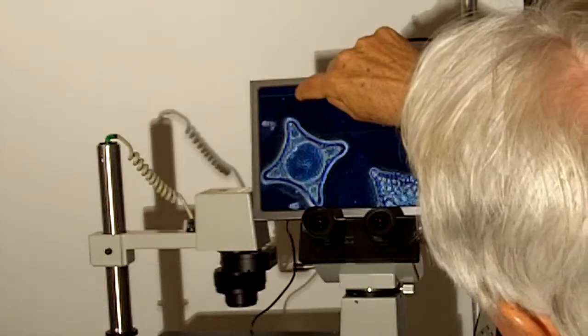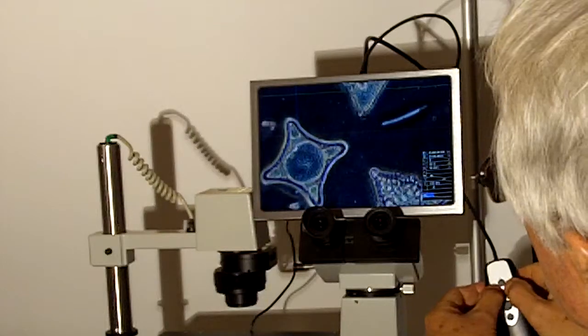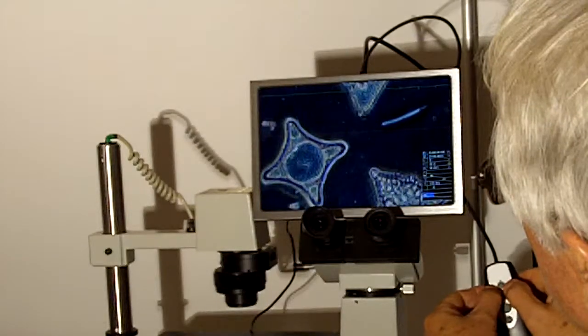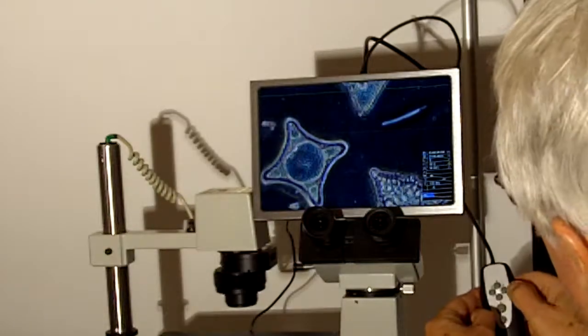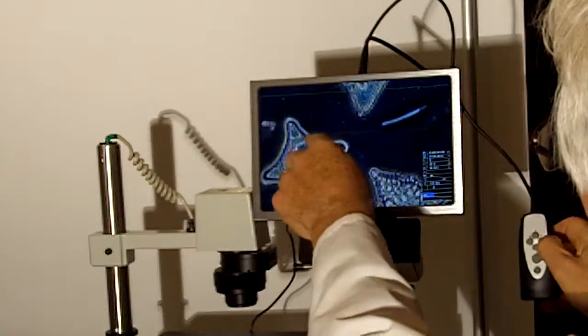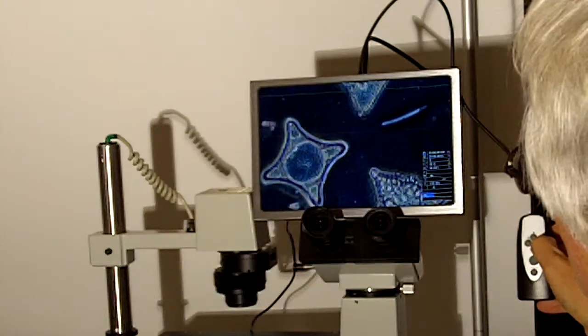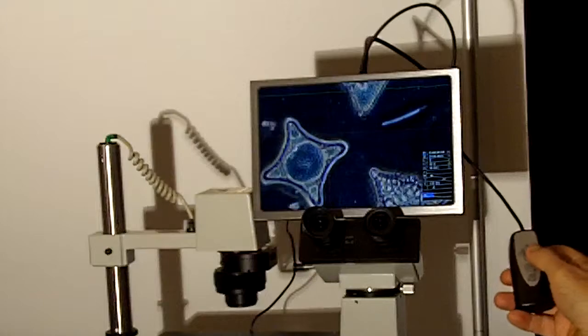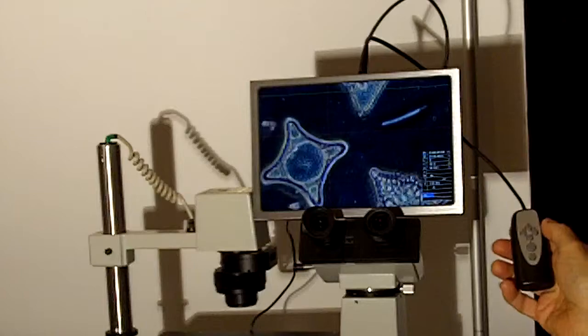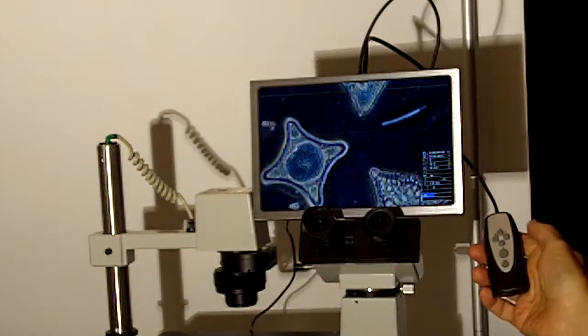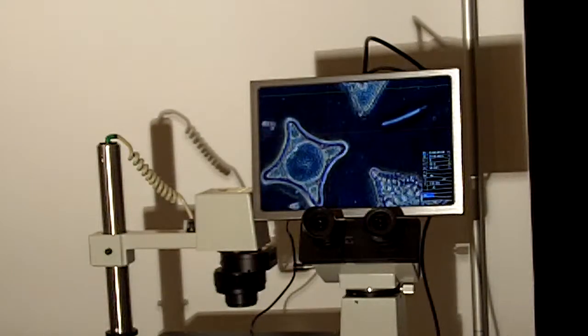Here we introduced a red vertical line. If we hit both keys at the same time, we can change colors, and we can also move those lines. This allows us to set up go/no-go situations or counting grids of our own design with these four vertical and four horizontal lines. Those lines will appear in the photograph.